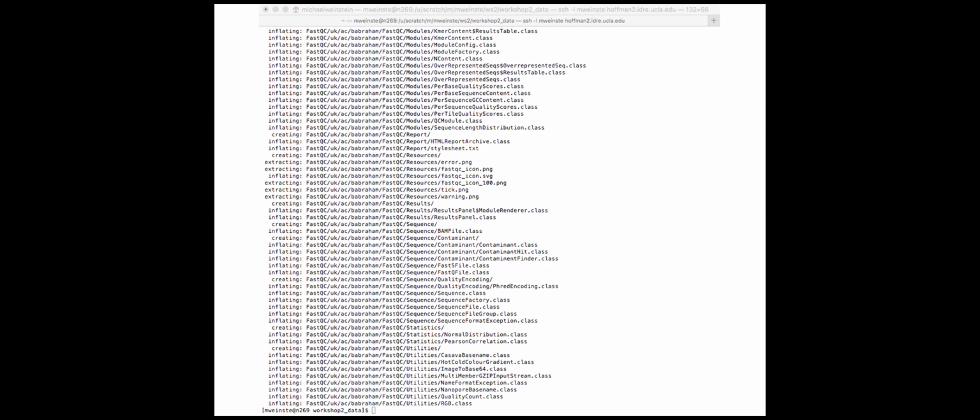All right, so we should still be in the workshop 2_data folder. And typically, you're going to see me do this a lot. This is a pretty common pattern: once I do something, I'll frequently hit ls. So just run ls and you should see that you have a new folder created called fastqc. So let's cd into that fastqc folder. Remember, capitalization matters and it's going to start with a capital F probably. So cd into that fastqc and type ls to have a look around and see what's in there.